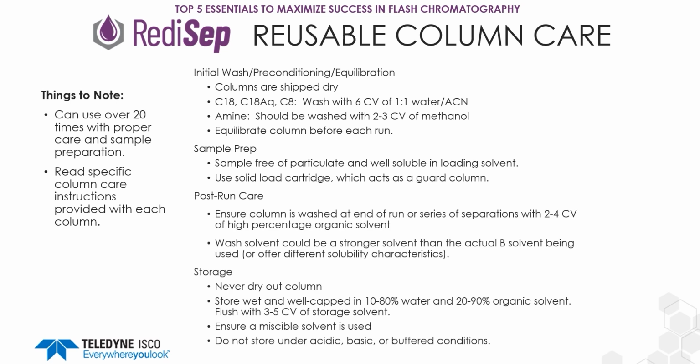A couple post-run care tips. I always like to end my flash runs with 100% of my strong solvent.